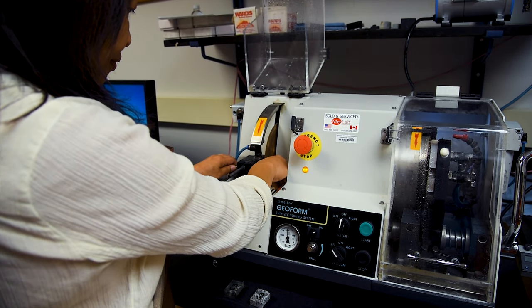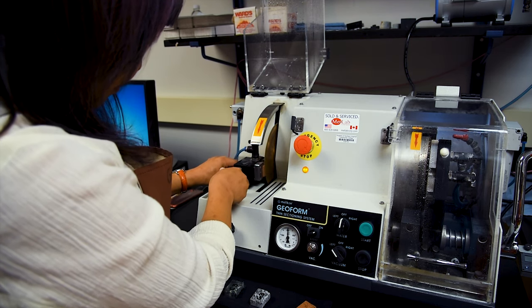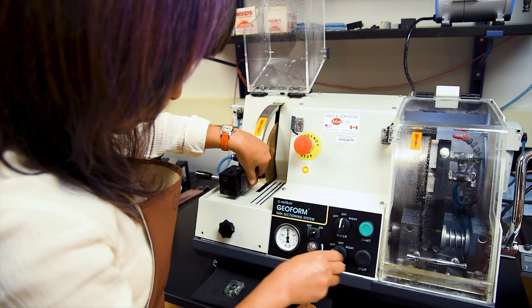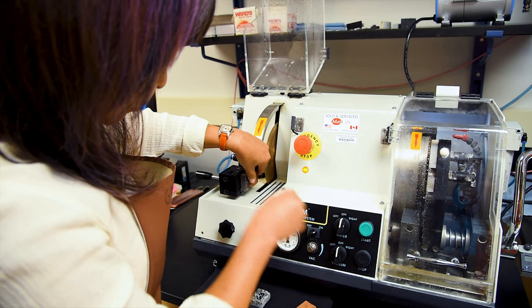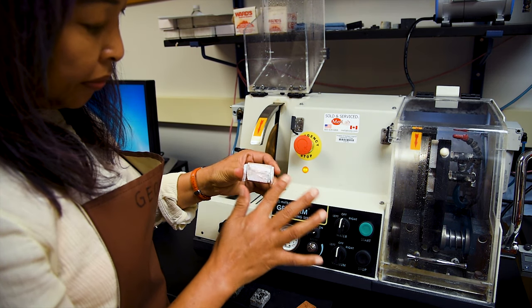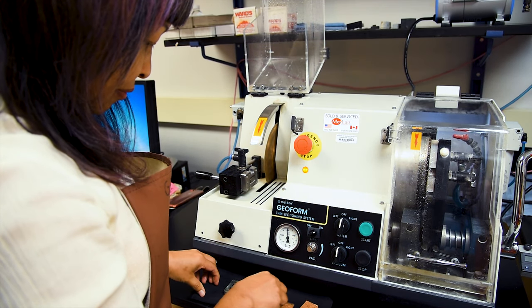Even if all goes well, the cutoff chips may also be polished and used to create additional thin sections, or saved as a reference chip to accompany the finished thin section. Finally, carefully pull the vacuum chuck away from the saw and secure the glass slide with your hand before turning off the vacuum pressure. The slide is now easily lifted away from the vacuum chuck and set aside until we are ready to begin the final grinding stage.